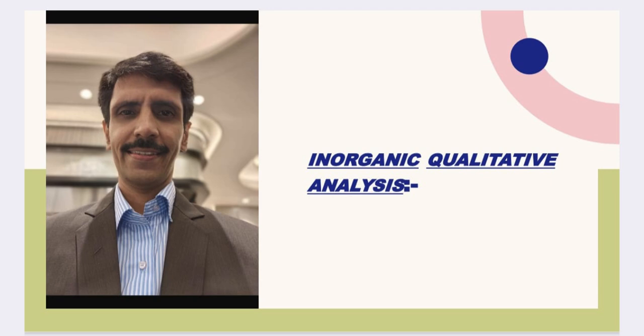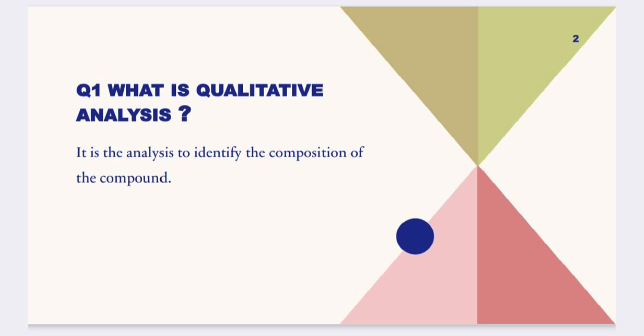My dear friends, in this particular video, I am going to discuss inorganic qualitative analysis. I'll try to make you understand what this experiment is all about in the form of a question answer pattern. So here we go. The very first question is, what is qualitative analysis? My dear friends, it is the analysis which involves the identification of the composition of the compound.